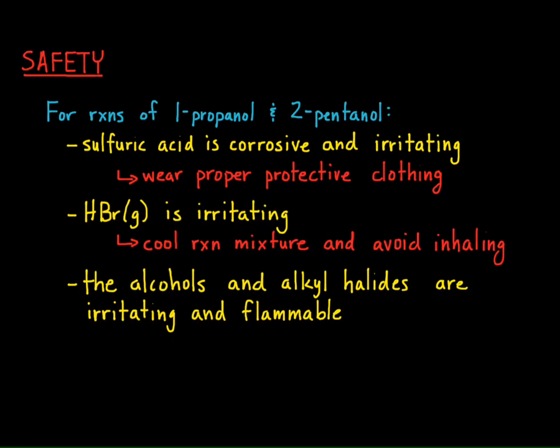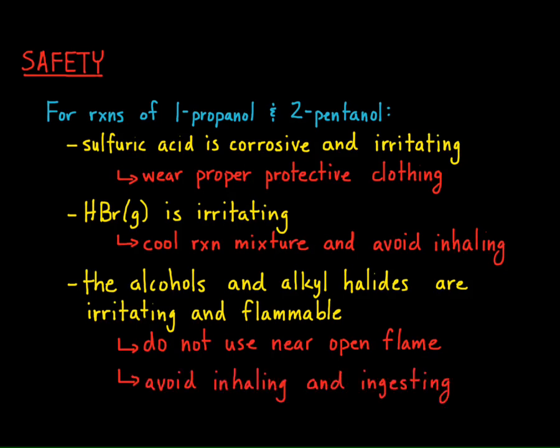The alcohols and alkyl halides are irritating and flammable, so do not use near open flame and avoid inhaling and ingesting any of the compounds.